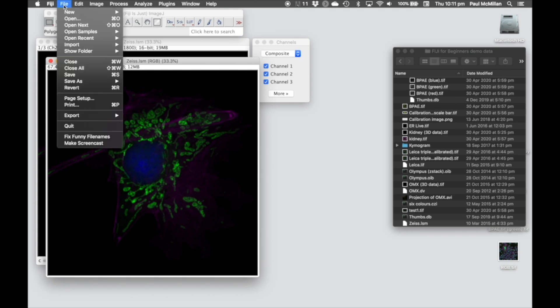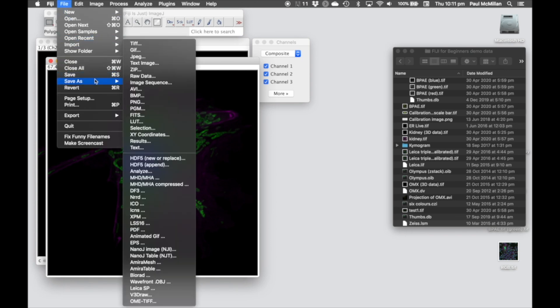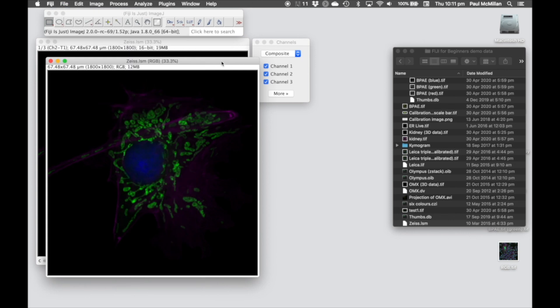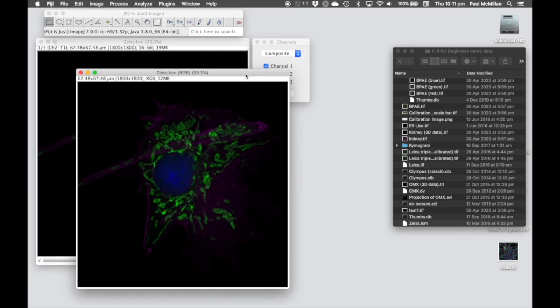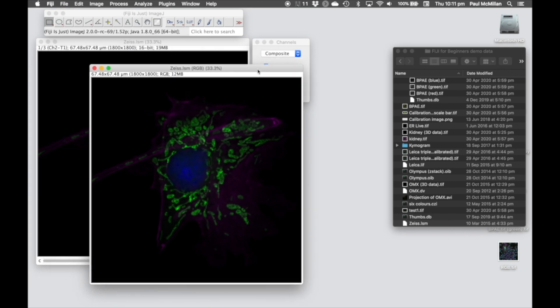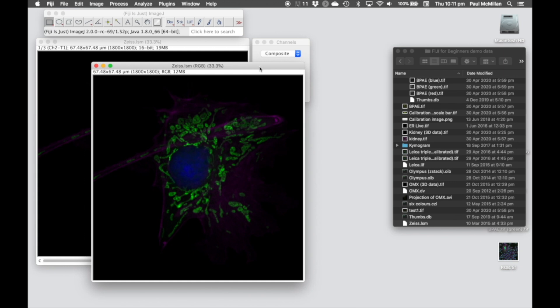So again, all we need to do now is go in File, Save As, TIFF to finalize that. So that's a really useful tool if you don't want to split out a stack, you want to do all the different changes within the stack, you can use the Channels tool.